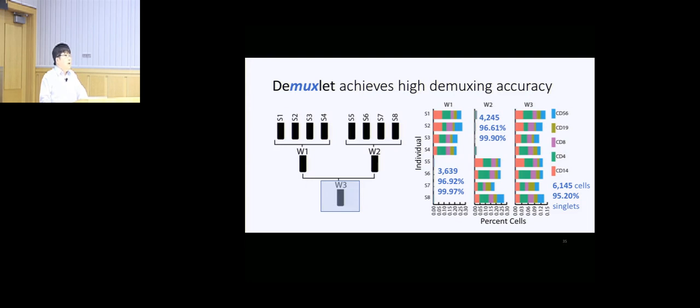So as I said, in 2 different settings, doing the 96 samples versus this way, it was about 6-fold and 7-fold differences just for the library cost itself. So the cost reduction could be more than an order of magnitude, so more than 10 times in a particular situation.